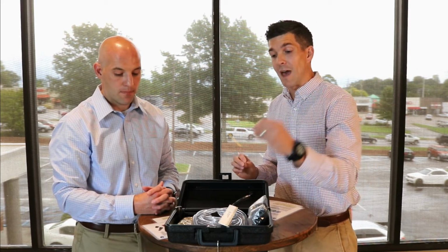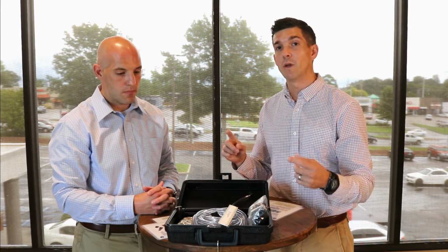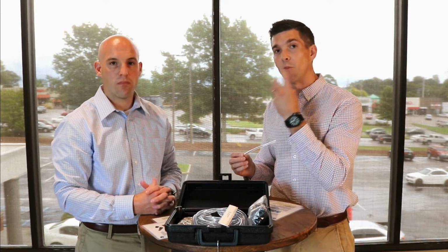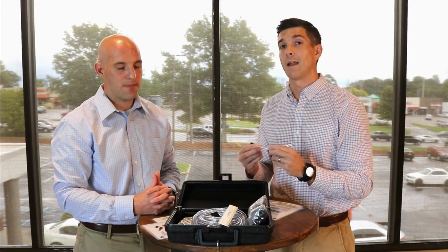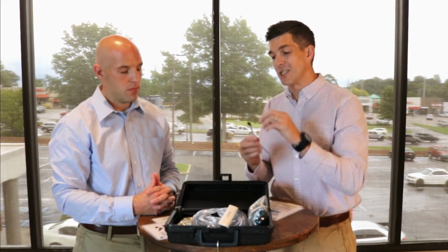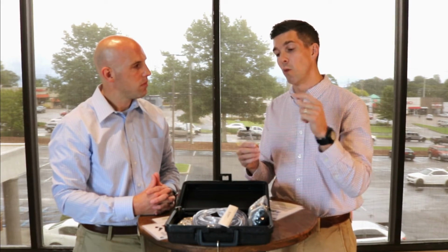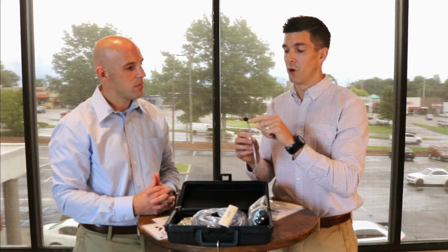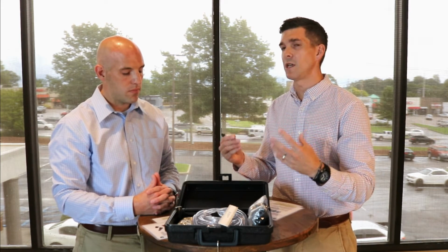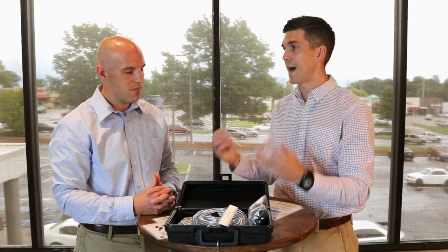Yep. So you have to have extra tubing. You have to run this tubing for every single fit test. Each one of those tubes has to be run into the breathing zone of the mask. Yep. And a lot of people miss that step. Again, check out the video where we go into depth on that. But it's not just the tube component that's a consumable. You have to have the suction cups, the little metal pieces that you put in there every single time. And so the requirements here are not just a cost one, it's also a time one.